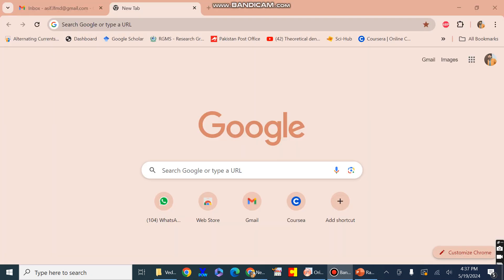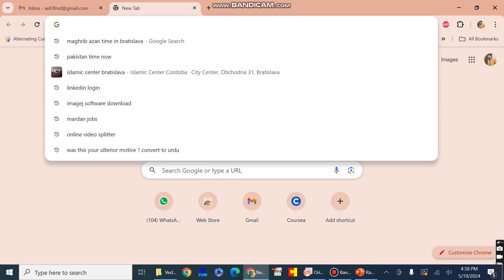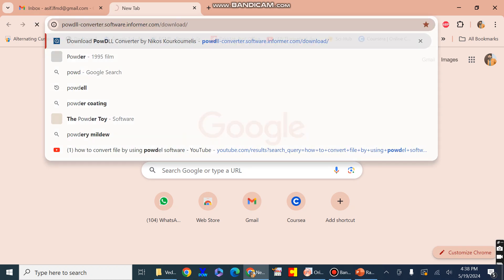In this video, first I will show you how to download the PowDLL software. This software is free of cost and easily available in the Google browser, and you can easily download it from there. In order to download it, just type "PowDLL" in your Google browser.